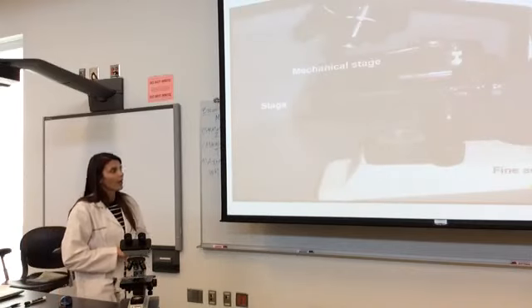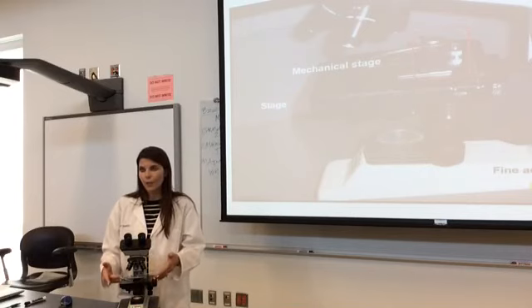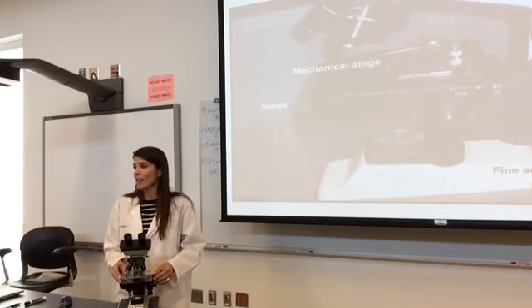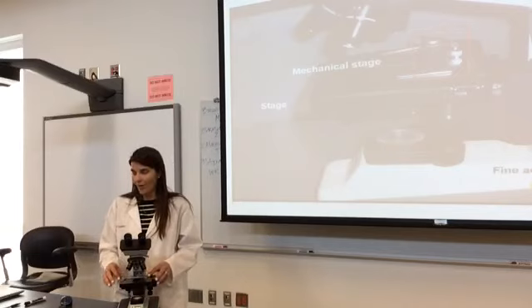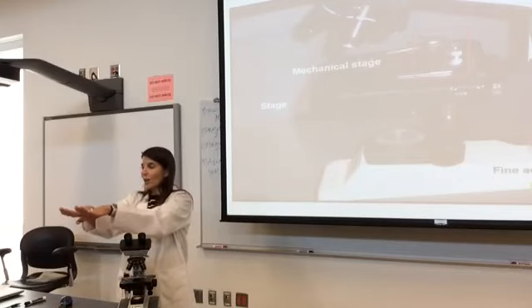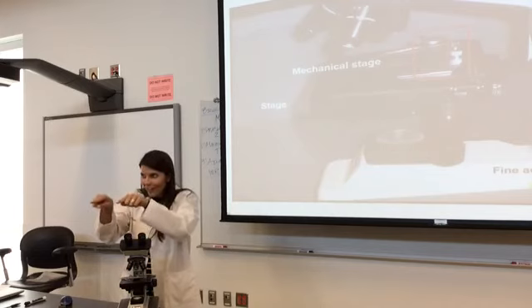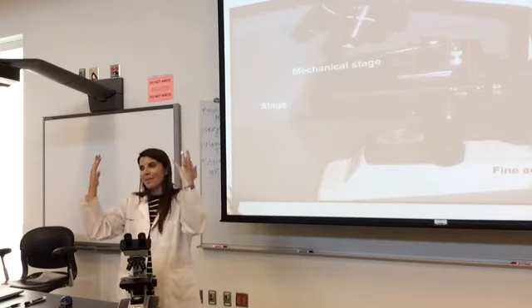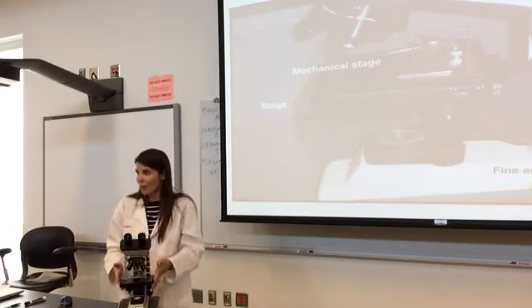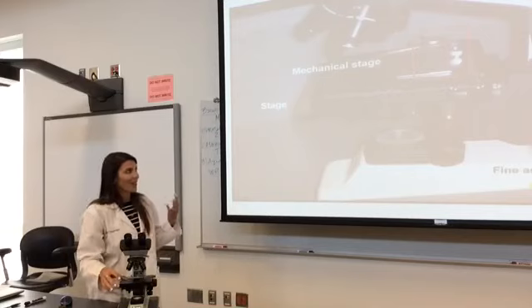Fantastic. Okay. Now our stage. So this black large portion is the stage. If you're around my age, or you had a high school that didn't have a whole bunch of funds, you did not have mechanical stages. You had two stage clips, and you stuck your microscope slide underneath it, and if you wanted to move your slide, you put your fingers on it and just moved it. And if you moved it too much, you messed it up. But you guys have these super nice binocular compound light microscopes that have a mechanical stage. I call it the claw. You can call it whatever.